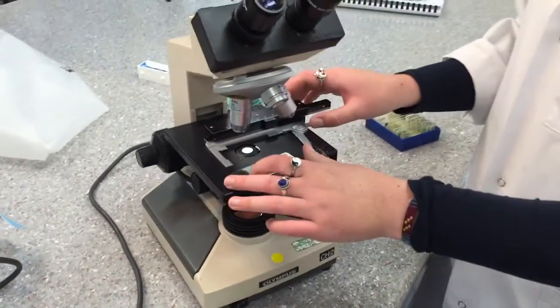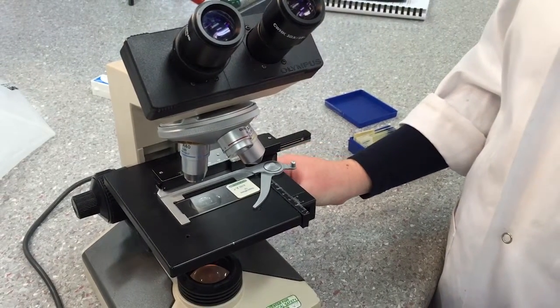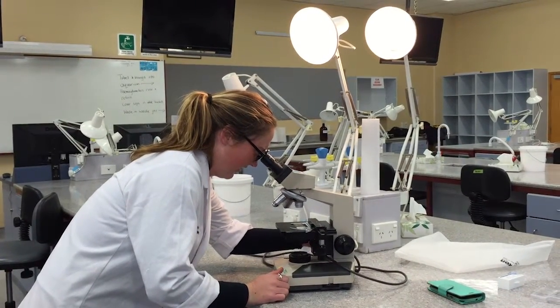For clean up, switch the power off. Open the spring-loaded finger and remove the slide, placing it in the appropriate place. Turn off the power and unplug the microscope, then wind up the cord.